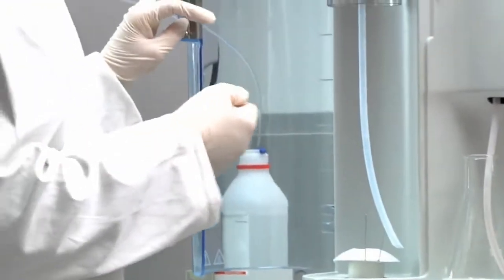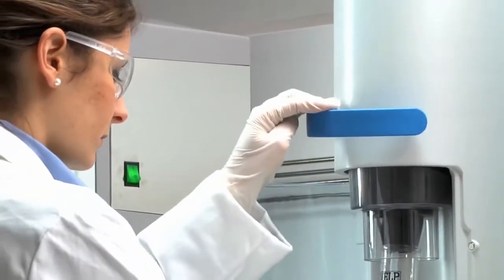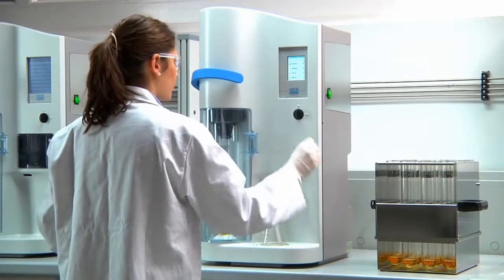Sample tubes are inserted without any effort, using the comfortable lever to displace the tube support and clamping the tube in place. The distillation takes place securely behind a transparent door.